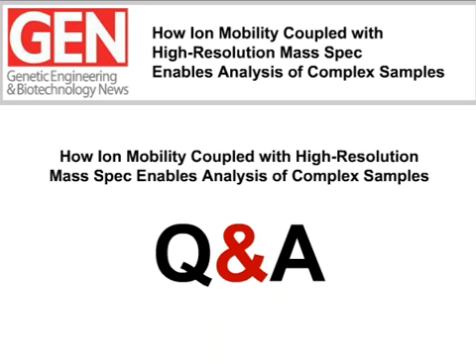George, are the fragment ions, once CID is performed, sent back through the drift tube prior to CID? Thank you, John. No. Once the ions are fragmented in the CID cell, they're transmitted forwards towards the TOF analyzer, where they undergo high-resolution mass analysis. And by the way, the CID may be selected on or off. You don't always want to do CID, so you may select to have fragmentation or not in that cell.